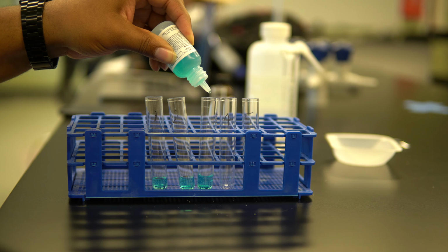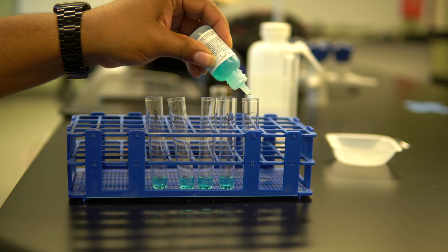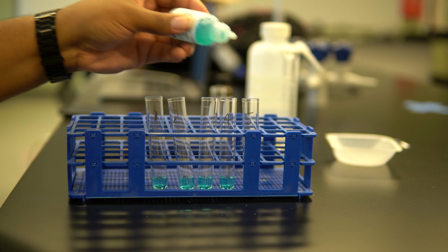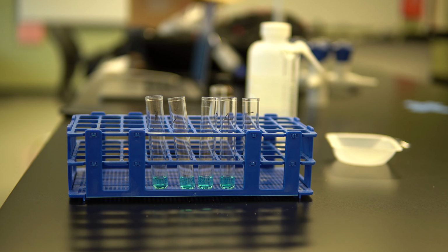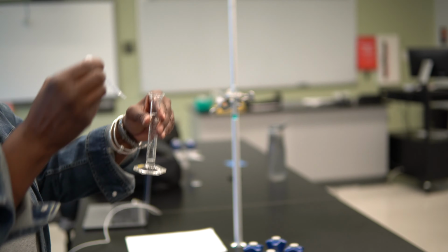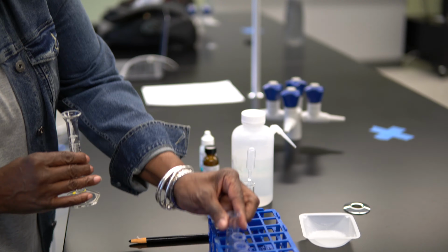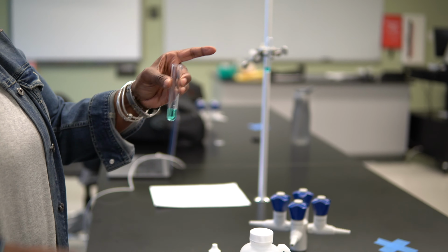Test tube number 1 will be the control and reference for color. Nothing will be added to test tube number 1. Record this color in data table 1. Using the 10 milliliter graduated cylinder, measure 1 milliliter of concentrated salt solution from the Erlenmeyer flask and add it to test tube 2. Gently swirl to mix.